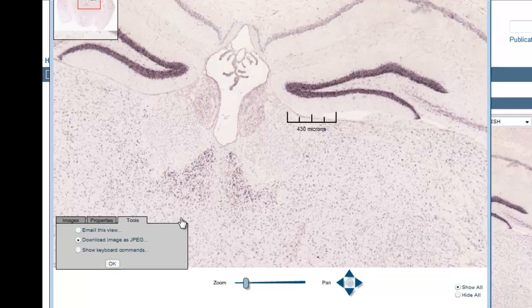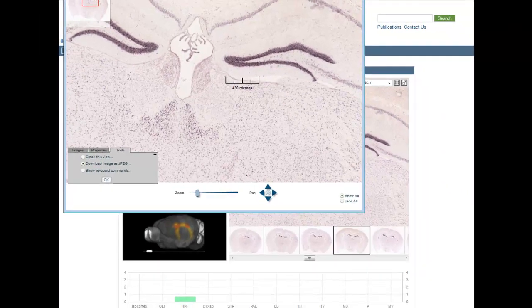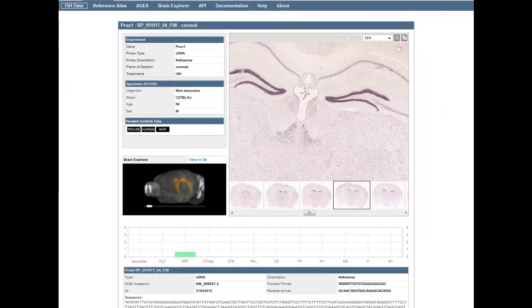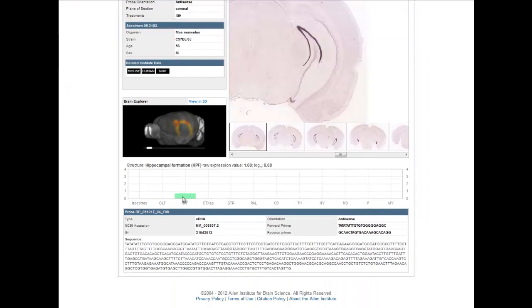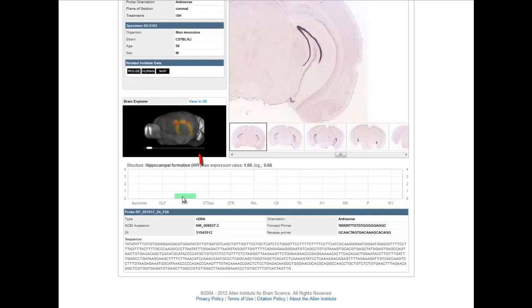Also on the Experiment Detail page is a histogram that provides quantitation of gene expression. Twelve large structures are represented on this histogram, and when you mouse over the structure, gene expression values are indicated here.